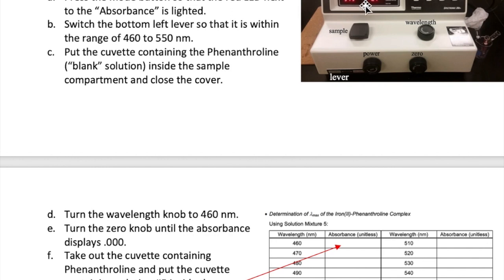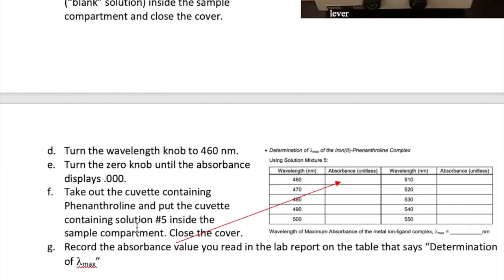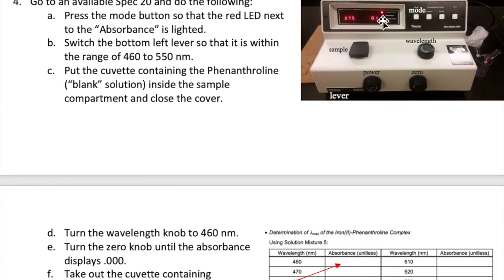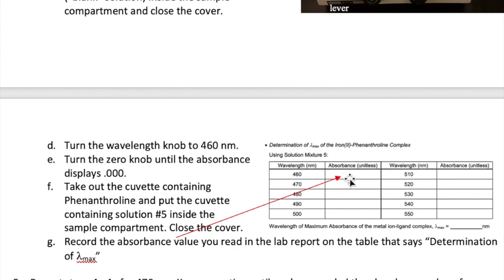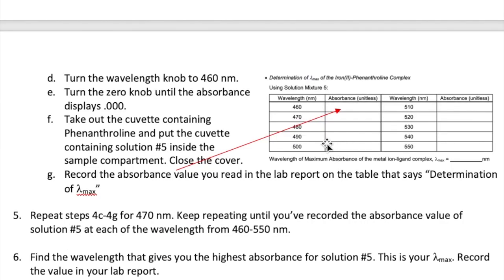Once the absorbance reads 0.000, take out the cuvette containing the blank and place the cuvette containing solution number 5 inside the sample compartment and close the cover. Read the value of the absorbance and record that in your lab report at the space indicated right here. You're now going to repeat steps 4C to 4G but at wavelength 470 nanometers. For every wavelength, you must blank the spec before measuring the absorbance of solution number 5. Repeat these steps again until you have scanned all the way to 550 nanometers. Look through all the absorbance values and find the highest value, then write the wavelength that gives you the highest value of absorbance here. That's your lambda max.